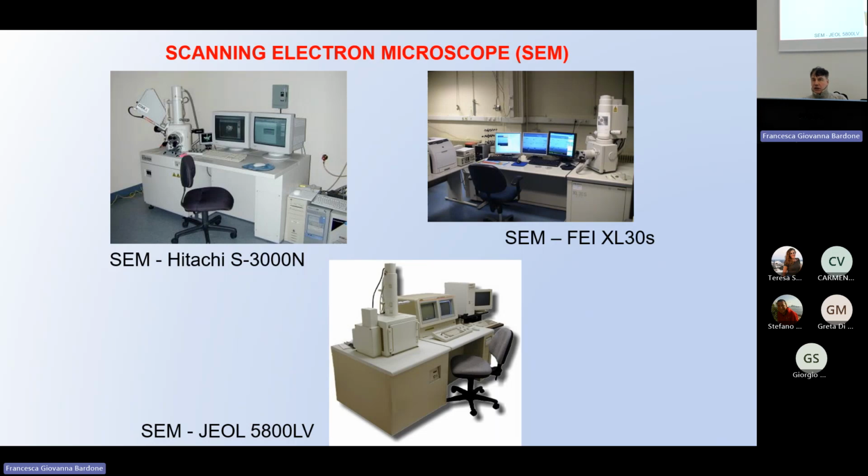So these are conventional scanning electron microscopes. Maybe you already found these instruments in many labs. These are conventional. I didn't put the E in front of the acronym. You have a chamber in which you place your material, and you have a sort of detector. Remember, using a conventional SEM, your material, biological, whatever, must sustain vacuum and must be conductive.